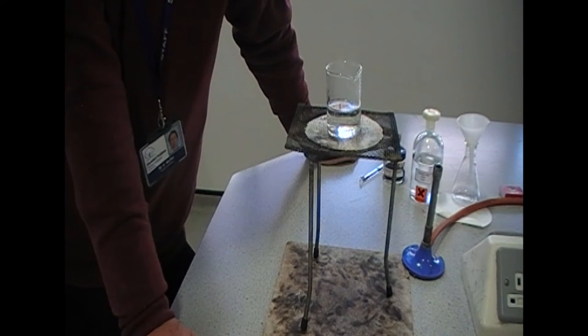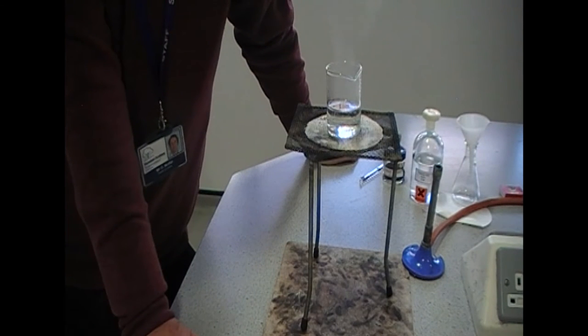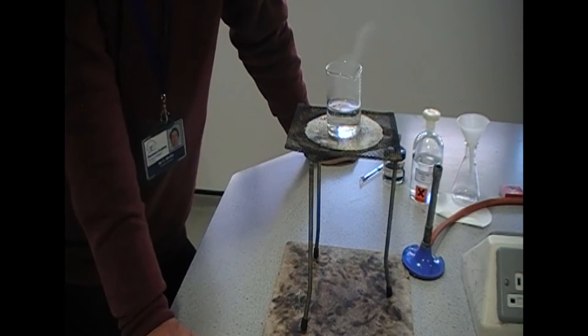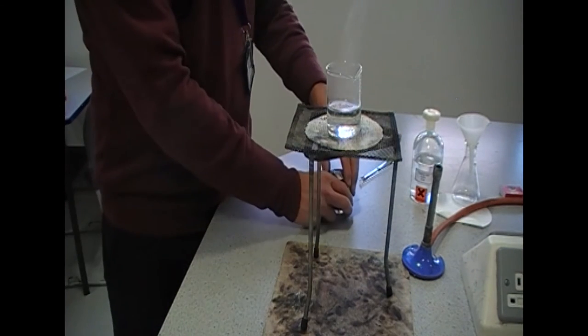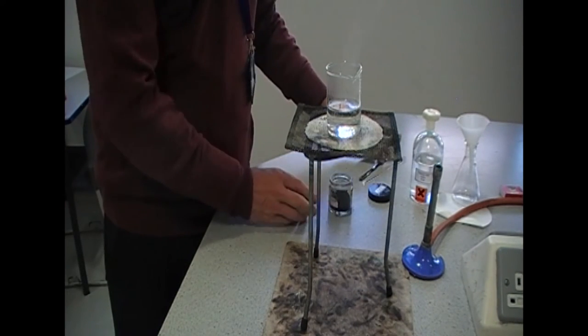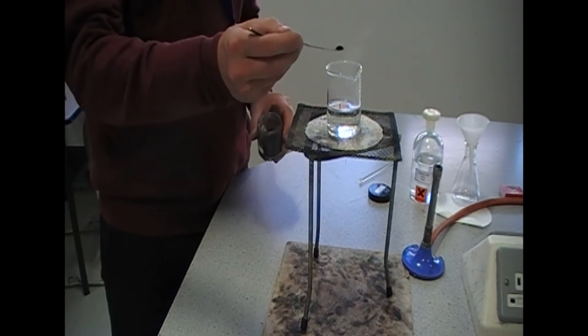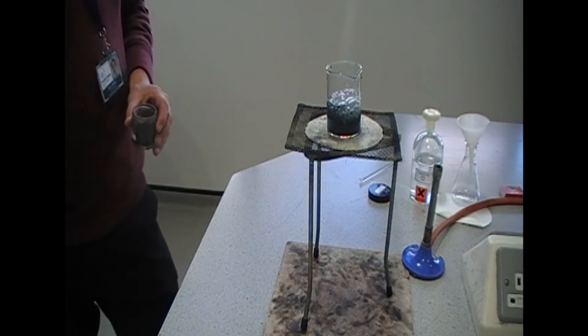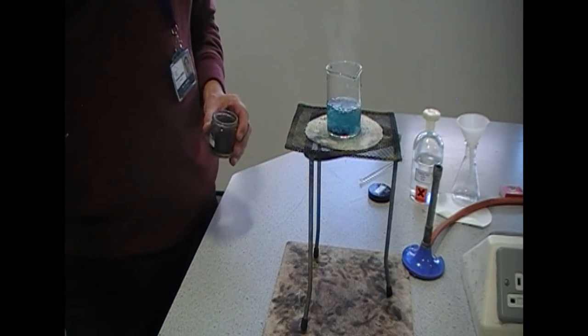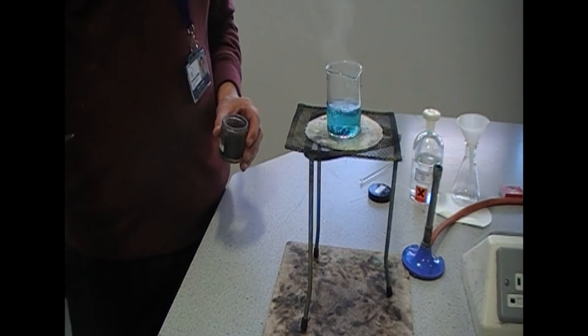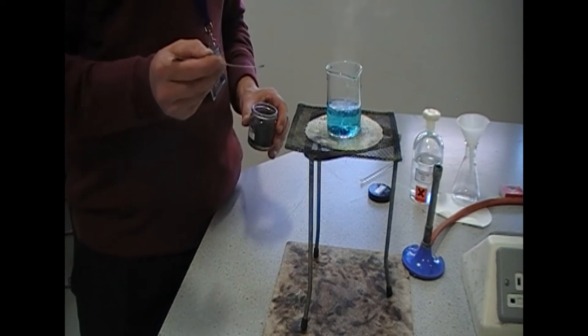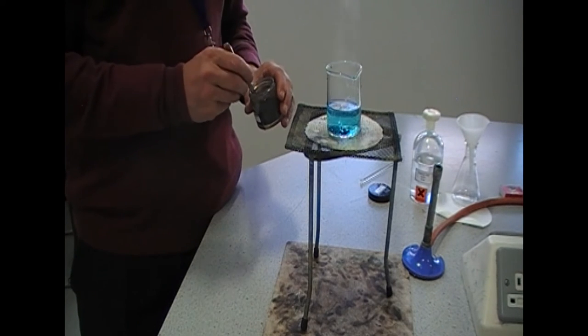Using the spatula, add small amounts of copper oxide at a time, stirring with the glass rod. So, copper oxide, spatula, small amounts. You can see it turns a blue colour almost straight away.